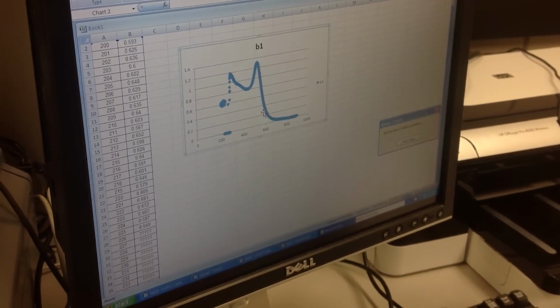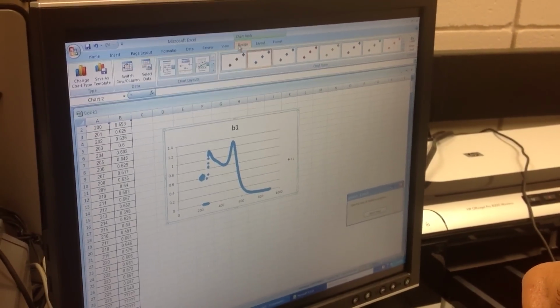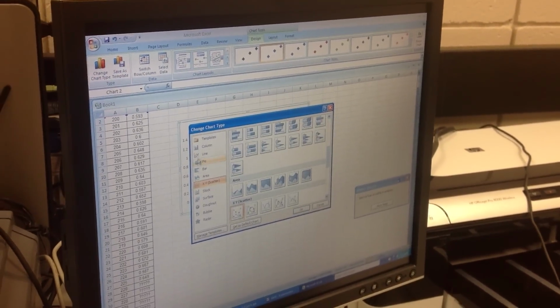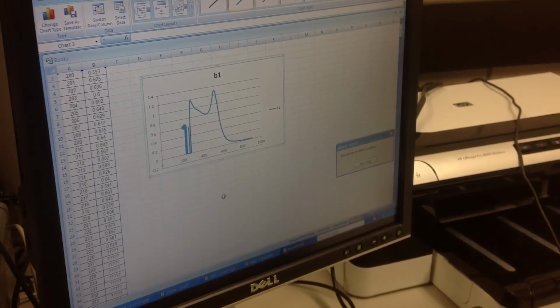And the thing that we probably will do is a scatter. Go ahead and change the chart type. Nicole, change chart type to a scatter without the points. We want the smooth line, and that'll help pretty it up a little bit.